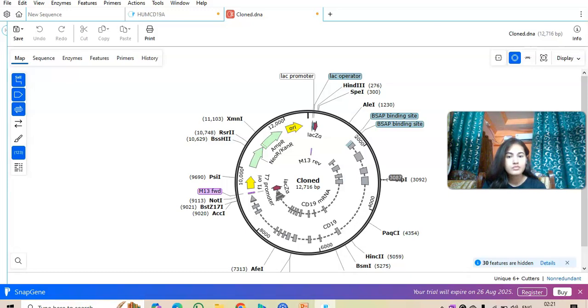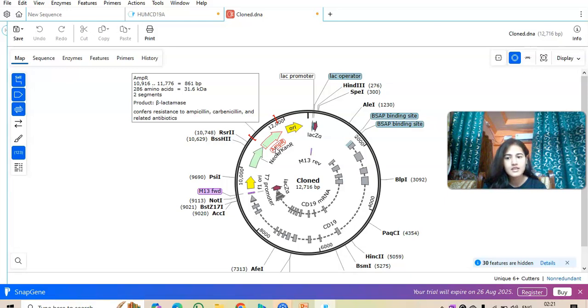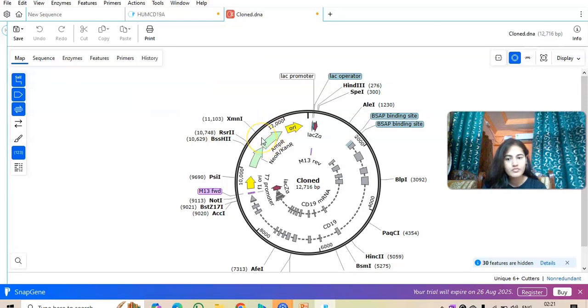You can mix and match with different techniques if you want. You just need to save the different clones. If you want to add any antibiotic resistance sites, you can do that, and if you want to add any markers, you can add that also. So it is a simple technique you can use for 2-3 different queries, and it is simple to generate the sticky ends because you are just using a few nucleotides. So I hope you understand this technique and how to use it using SnapGene.